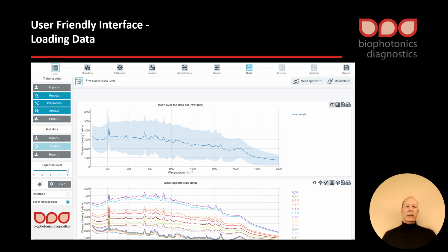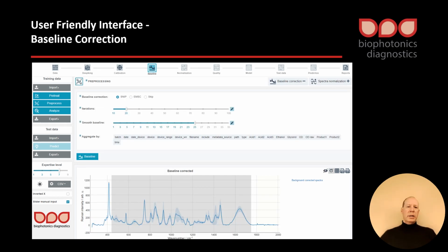And here you see the spectra taken from that bioprocess, and you see the broad range of spectra intensity coming out during the complete run of that bioprocess. If needed, despiking and also wavenumber calibration can be done. I do not show this with a screenshot.